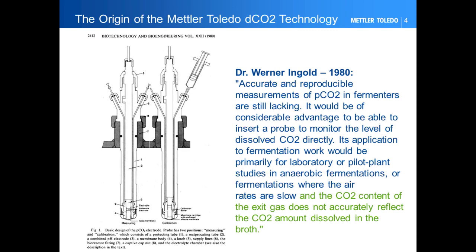And to finish quickly on the METTLER expertise on dissolved CO2 sensors, the picture on the left is representing the original design from Dr. Ingold back in 1980. But more interesting is the statement Dr. Ingold made at the time in this article speaking of fermentation. The CO2 content of the gas outlet doesn't accurately reflect the dissolved CO2 content and its accumulation in culture media. So let's have a look at the principle and method of measurement.